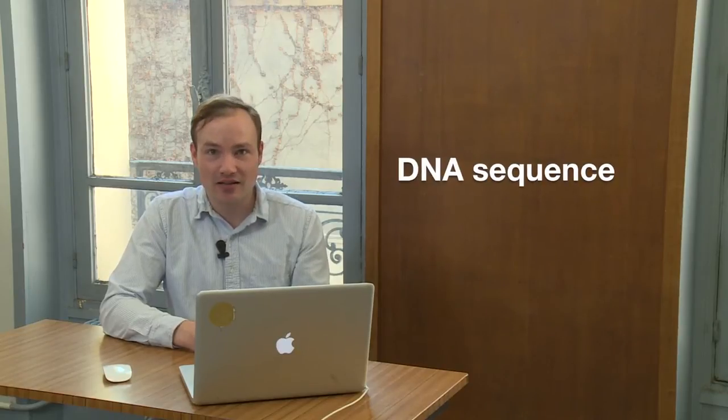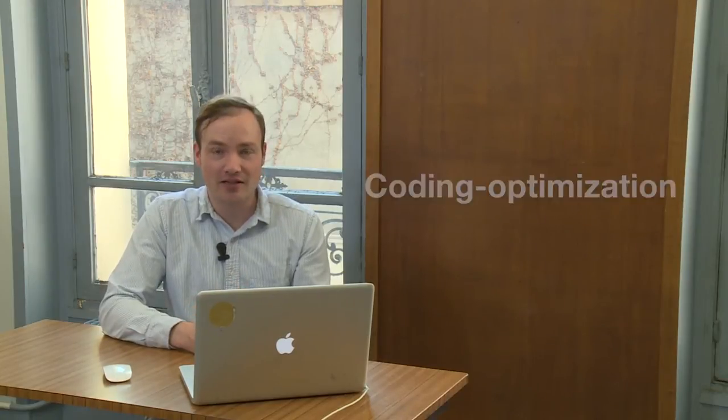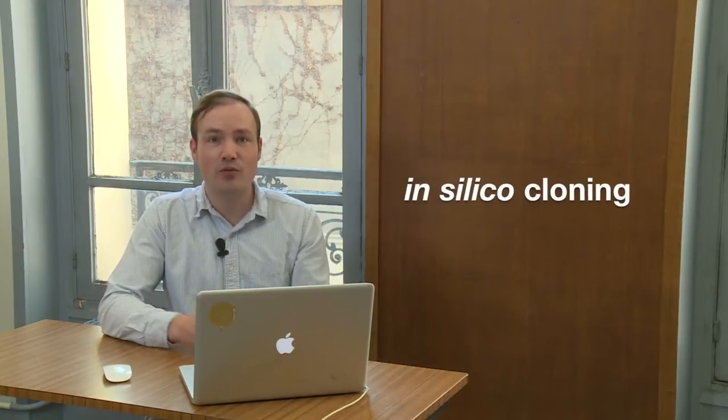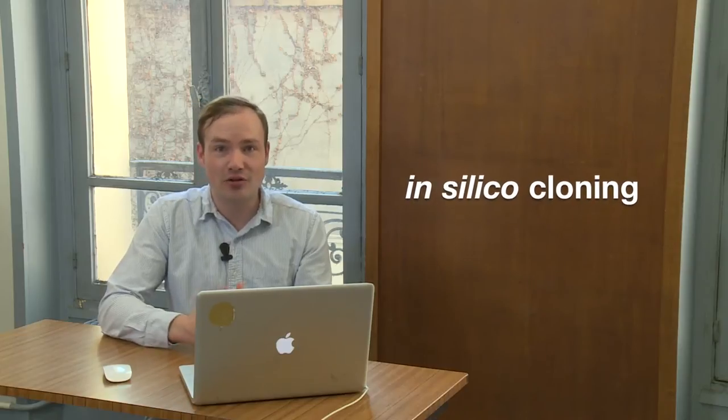Okay, hi everybody, welcome to our very first DNA design tutorial. Today I'm going to show you how to create your very first biobrick. We're going to find a DNA sequence coding for an enzyme from a public DNA database, codon optimize that sequence, and then clone it into a standard biobrick vector using standard biobrick restriction sites. This tutorial should be useful for anyone starting out on an iGEM team, anyone interested in iGEM, or just anyone interested in DNA sequences, how they work, and how to clone them.